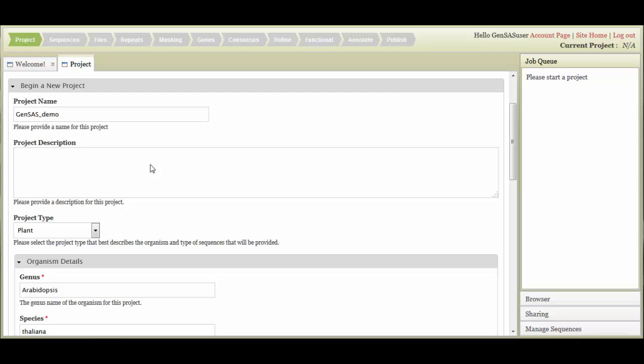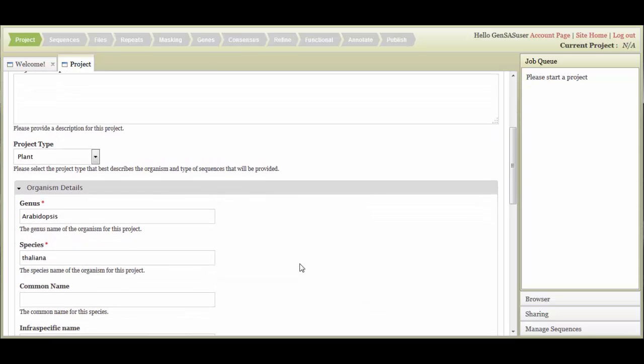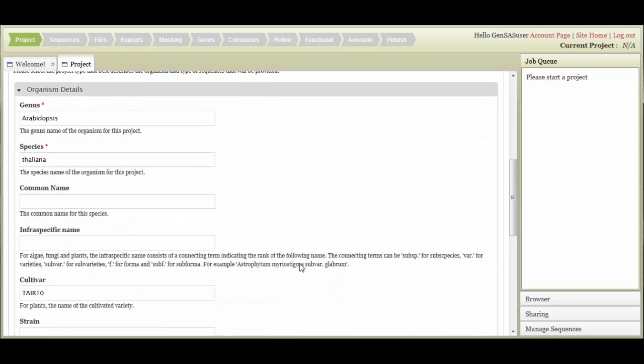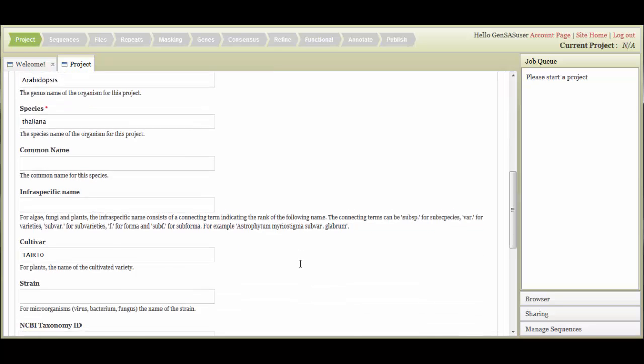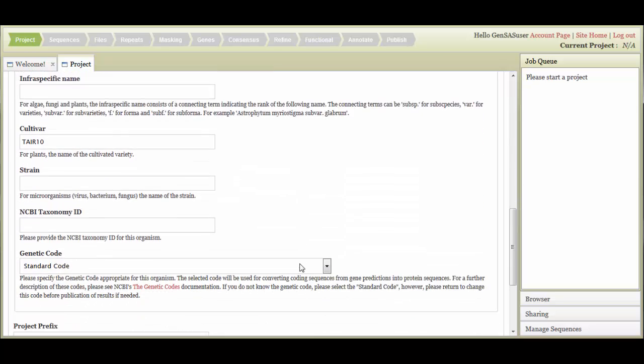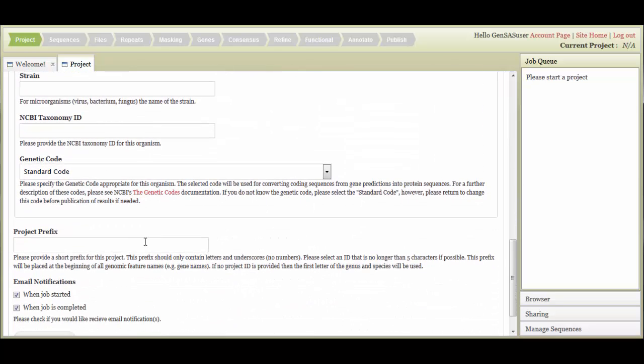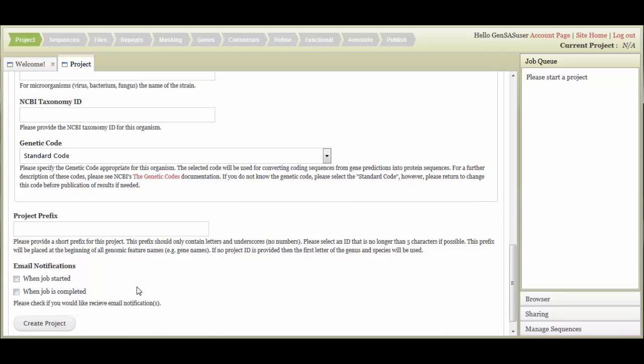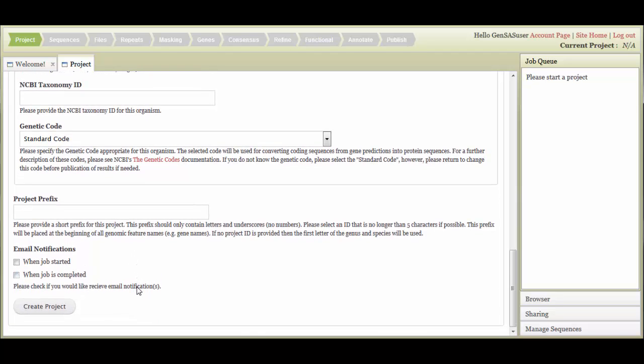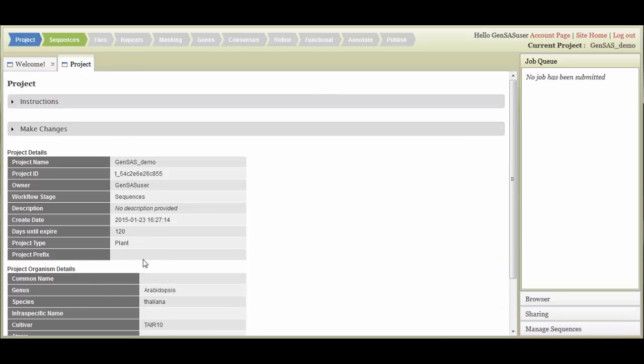When beginning a new project, you will need to provide a project name, choose the project type, and enter the genus and species of your organism. The other information is optional. You can also choose to enter a project prefix for your gene model names. If you leave this blank, GenSaaS automatically uses the first letter of the genus and species as the project prefix. You can also control the number of emails that GenSaaS sends you during the annotation process. Once everything is entered, just click the Create Project button, and the summary screen will appear.